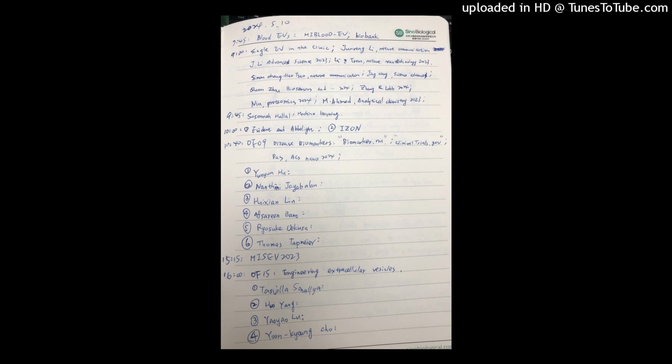So based on all this background, we plan to perform dual surface protein profiling on single EVs via NFCM and to classify EVs into different subtypes, aiming to improve the clinical efficacy of early diagnosis, prognosis, and subtyping.